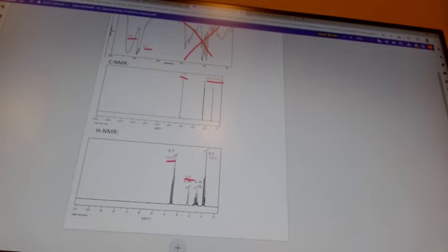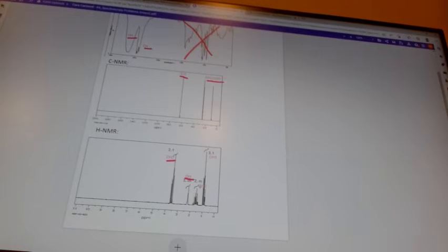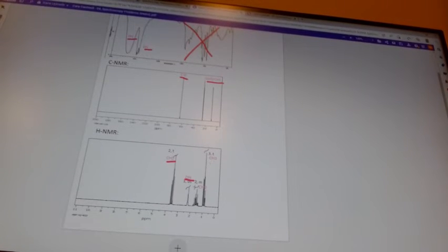It's lonely. Okay, so for the second peak, it's going to be a CH2. It's a multiplet. It's going to have a lot of neighbors. It has a lot of friends, something the OH does not have. It's lonely. So now moving on to, oh, I forgot to underline. Okay, so now moving on to this one. This is a CH3. It's a triplet, so it's going to have two neighbors. But yeah, this is a CH3.